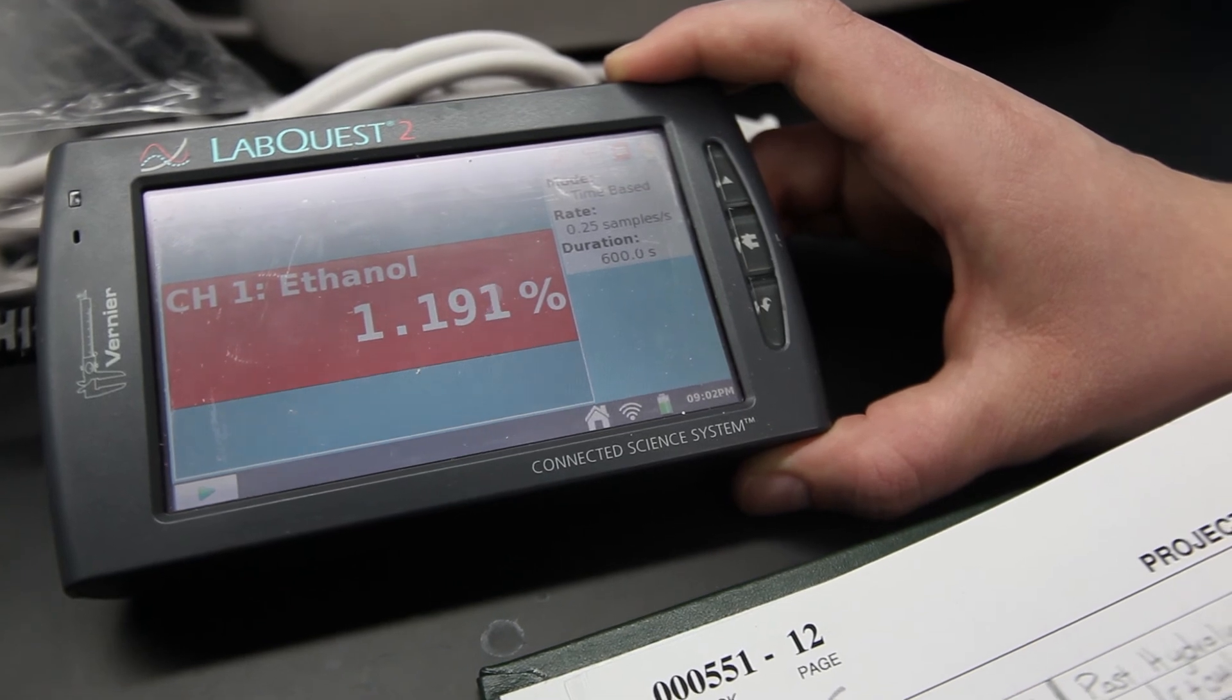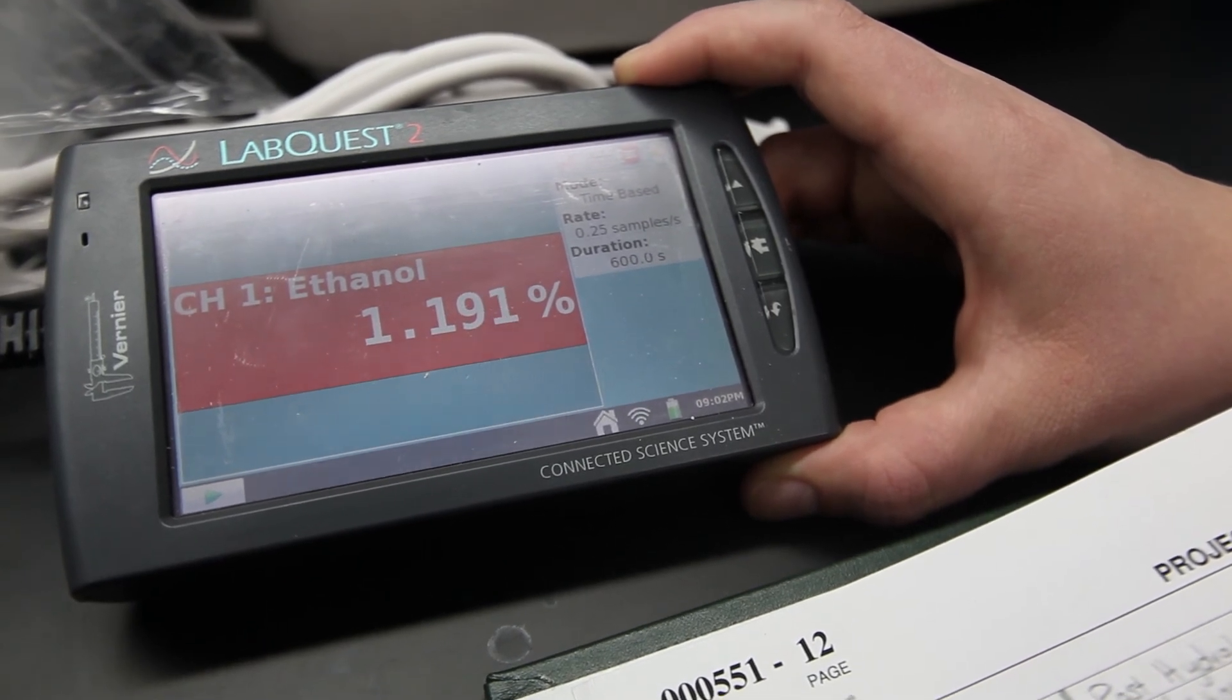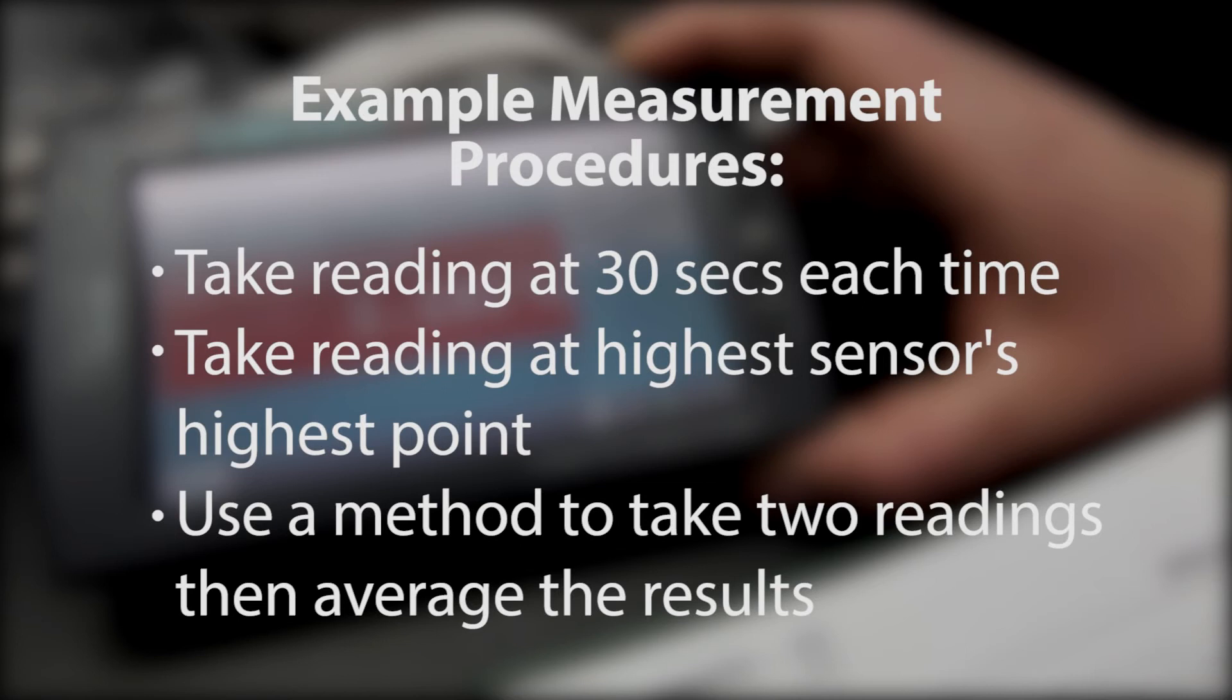It is best to wait one or two minutes for the reading to stabilize to the nearest tenth of a percent. You can take readings in less time, but it's important to be consistent across measurements.